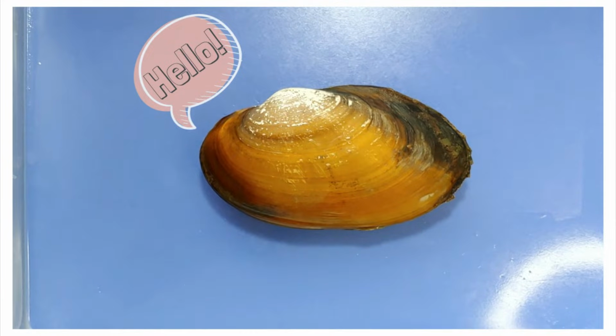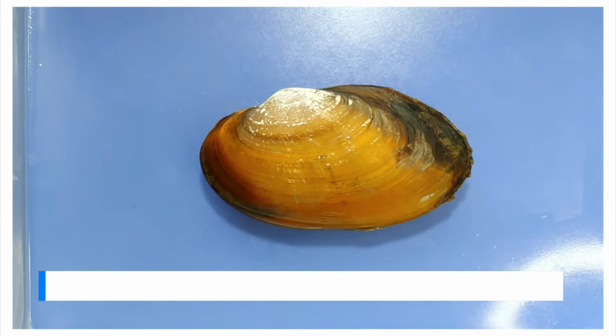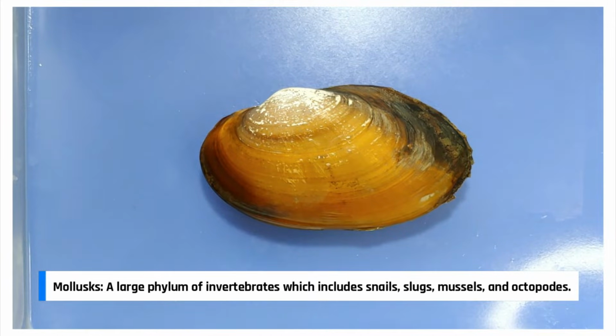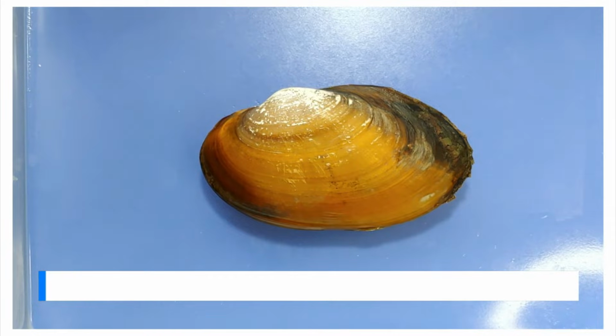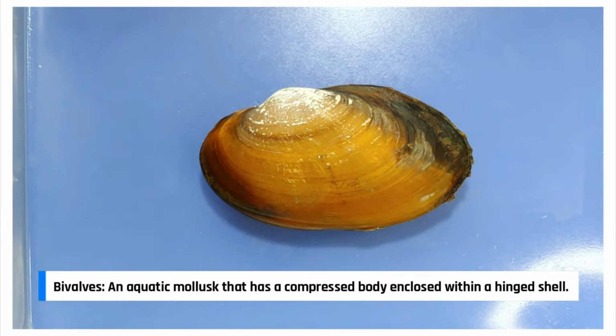Today we'll be looking at the anatomy of a clam. Clams, aside from being delicious to eat in a chowder, are also part of a large group of animals called mollusks. Mollusks include everything from octopods, squids, and cuttlefish. Because clams want to feel a bit more special, they're also part of a smaller group called bivalves, named as such because it has two shells.